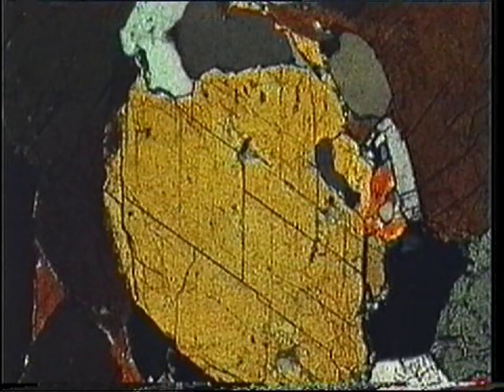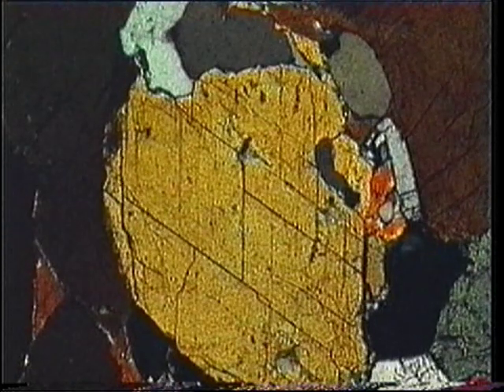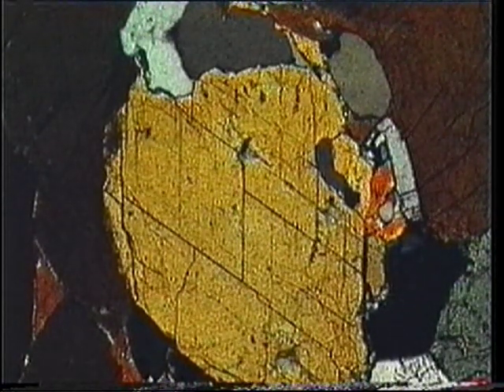Most grains show cleavage traces, as here. A few grains like this show two sets of cleavage traces at an angle which can be estimated or measured. In prismatic sections, we see only one set of these cleavage traces parallel to the prism.